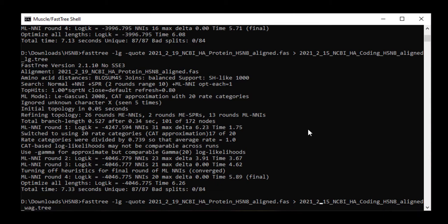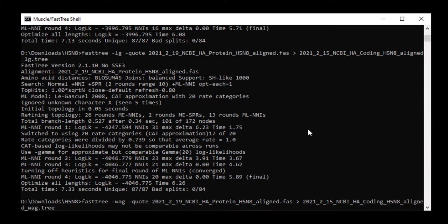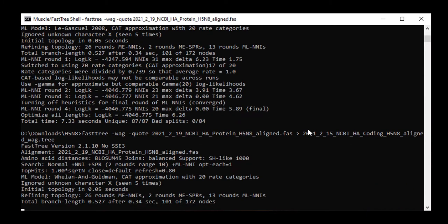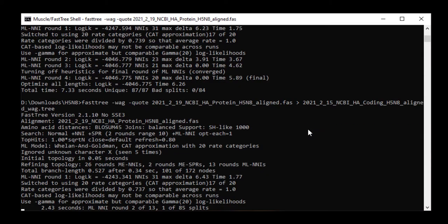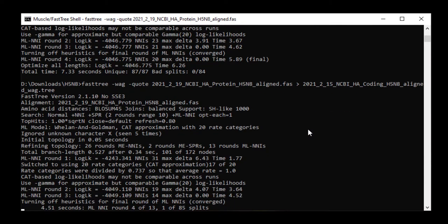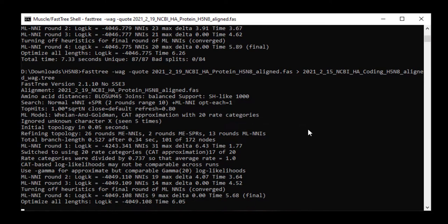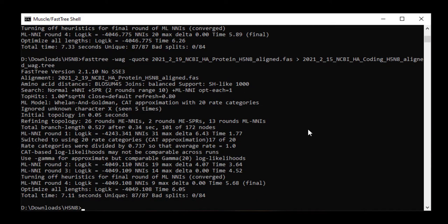I then repeated the process for the -wag tree and note that I saved all of the trees with different file names so that I can compare them later. So I added lg and wag to the file names so that I know which of the different models I use to make each of the different trees.